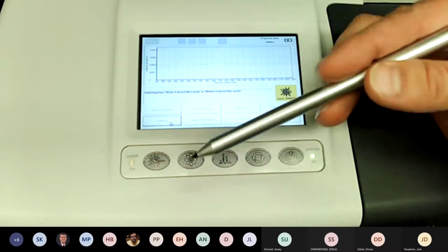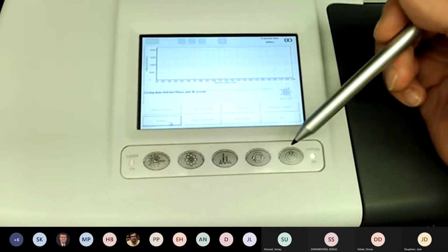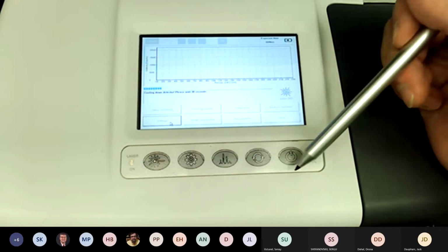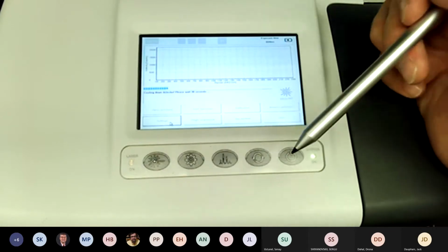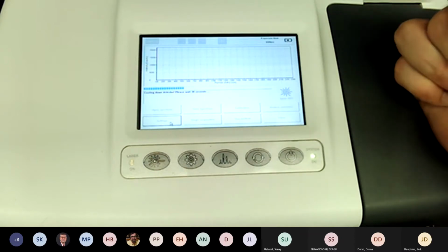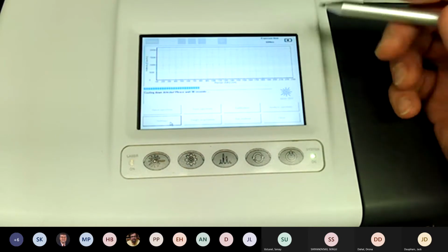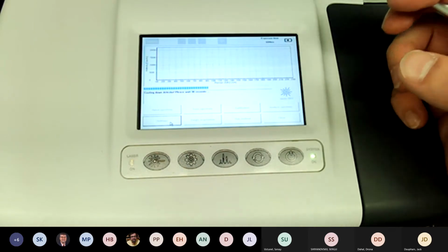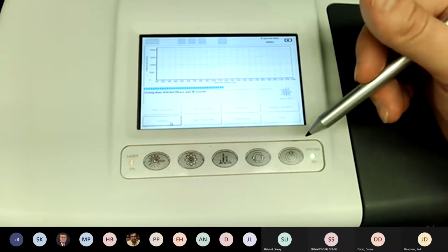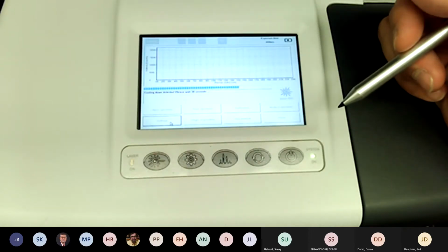They said mostly these indicator lights are going to be what you're going to look at. These buttons, you can use them obviously to look at the advanced settings, spectra, reset settings. You likely won't even use these, especially once we get it hooked up to the computer here. You can run the instrument itself straight from the computer with a nice big screen and don't really need to deal with the screen at all, other than the power on and arming the laser, which you'll still need to use from here.